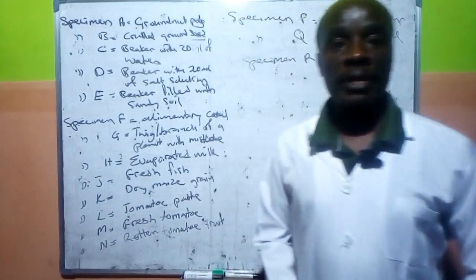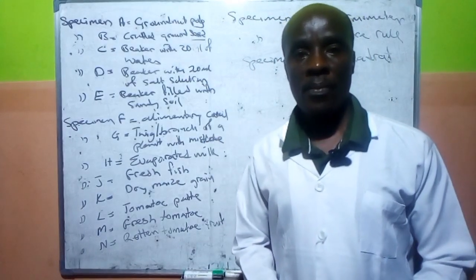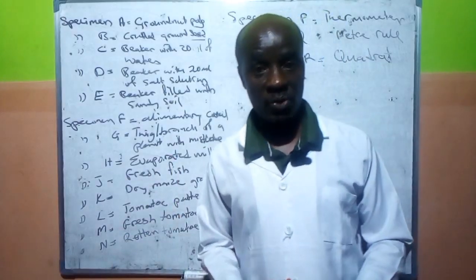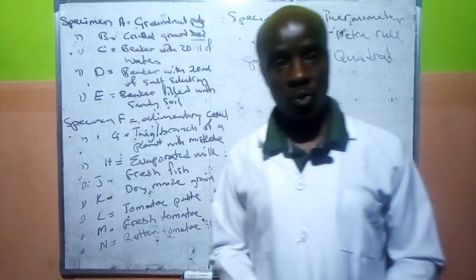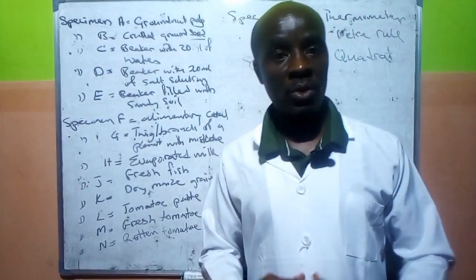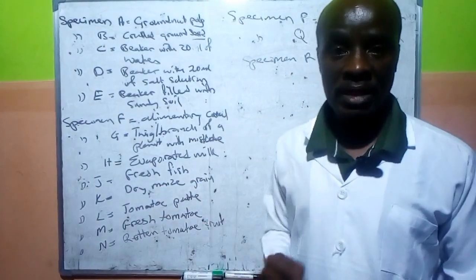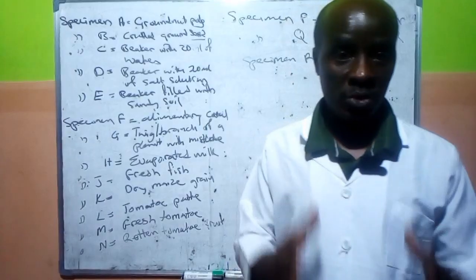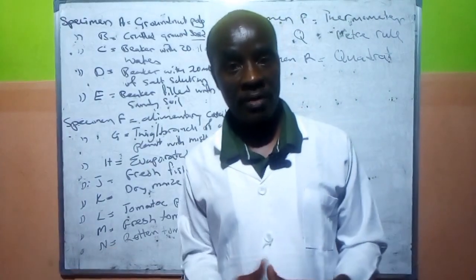Today we are going to be looking at the biological practical exam. We're going to look at generally what we are likely to be expecting in this very exam, and I want you to pay attention and watch to the end, because there are some sensitive experiments that will show here. I will display it live so that you'll be able to see them and be sure that this is possible based on what we have here.